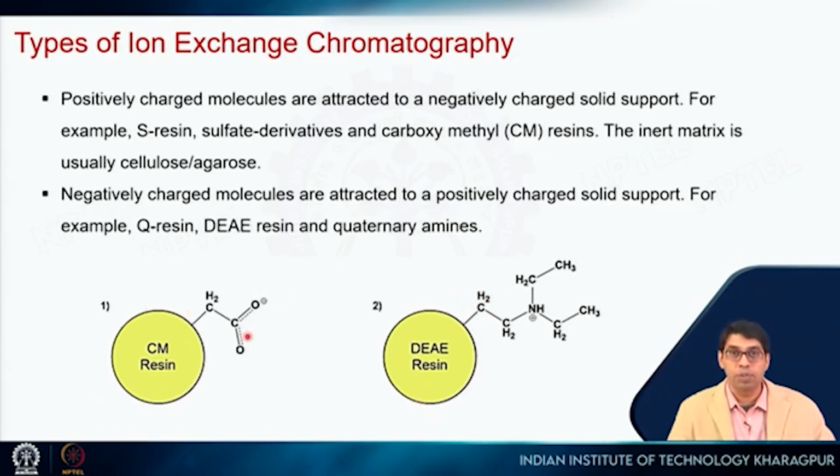linked, and these groups are negatively charged or positively charged. So, this will bind to positively charged protein and this will bind to negatively charged proteins. In this case the resins will be Q resin or DEAE resin or quaternary amines.